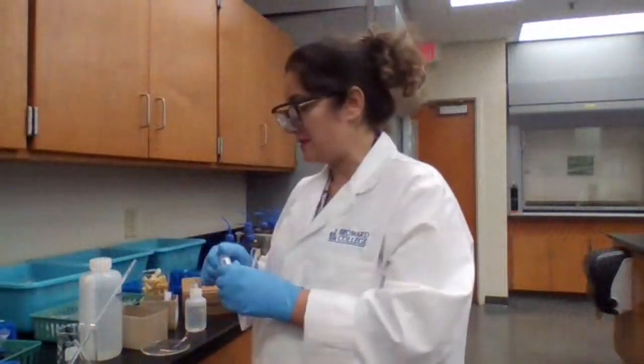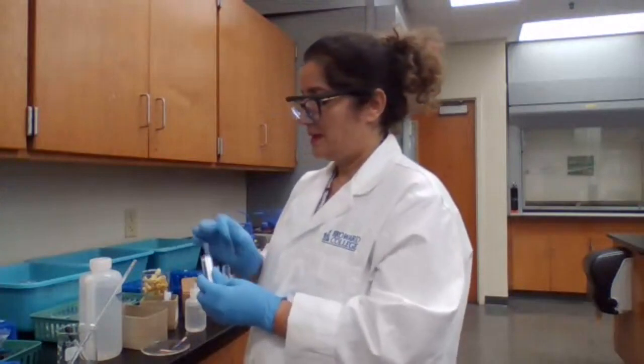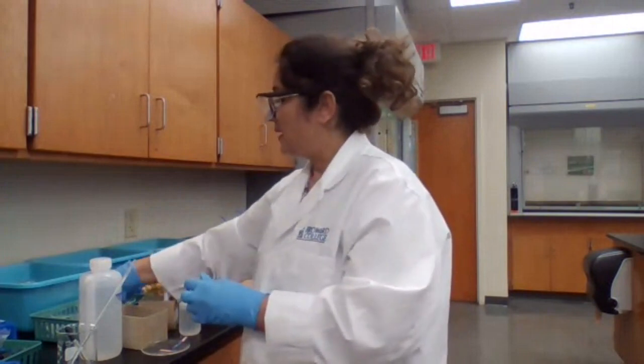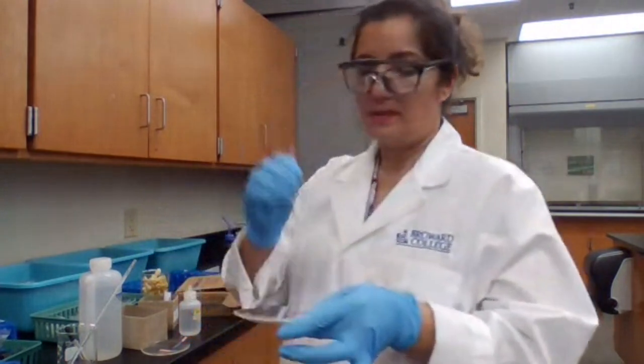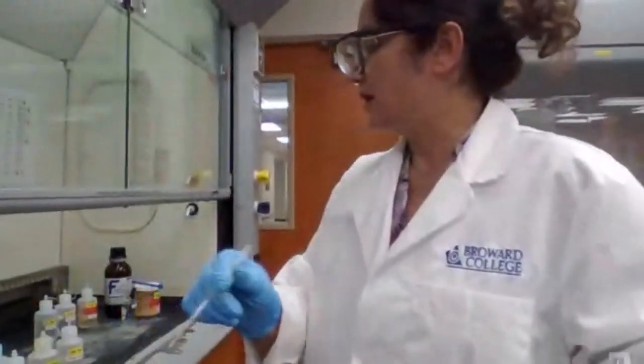If I take a piece of blue litmus paper and place it in a watch glass, I'm going to add acetic acid, mix it well, and take a drop and add it to the litmus paper. I show you the color because it's a blue litmus paper now. When we add enough acid and it's acidic, it would be changing from blue to pink color.